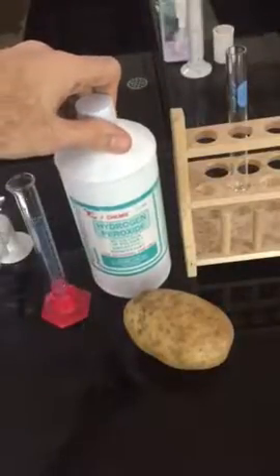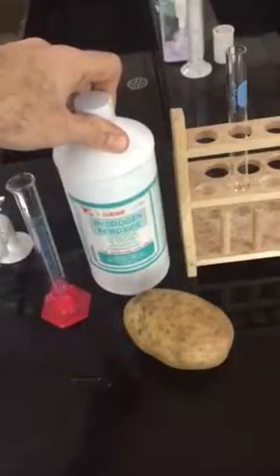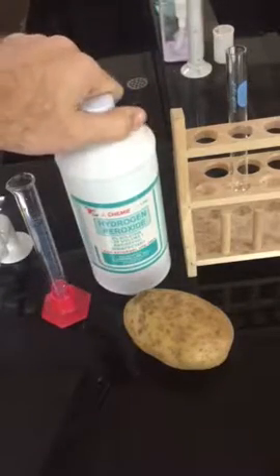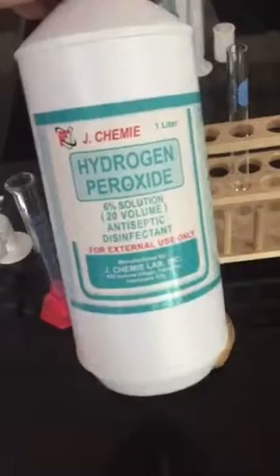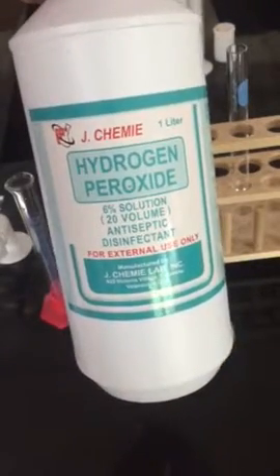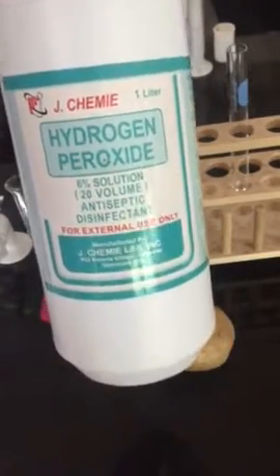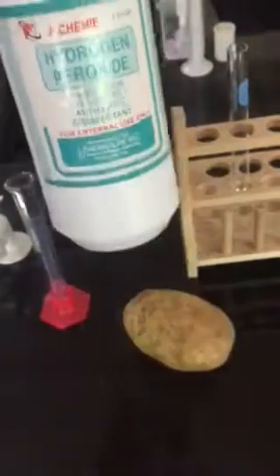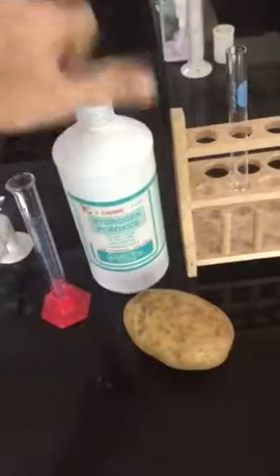All right, got a few simple ingredients here for our quick design lab on enzymes and rate of reaction. So our substrate here is going to be this hydrogen peroxide, H2O2. This is a 6% solution, but of course, one of the variables that you may be playing with is the concentration of the substrate. So you're going to have to change that. But here's our starting point.